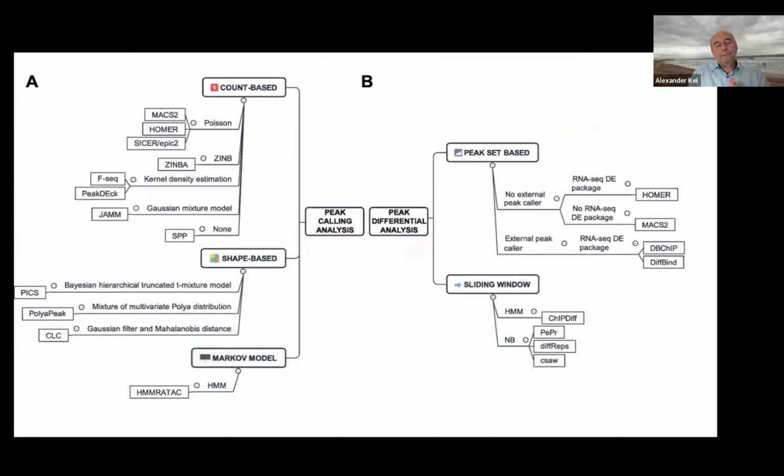All right, and in this paper, there was a very good presentation of various algorithms which we have to analyze ATAC-seq data. These are available in different packages. In our platform, we have a few of those algorithms which we mainly use, for instance, MACS2 to call for the peaks, or other types of algorithms to analyze the shape of the peaks and things like that.